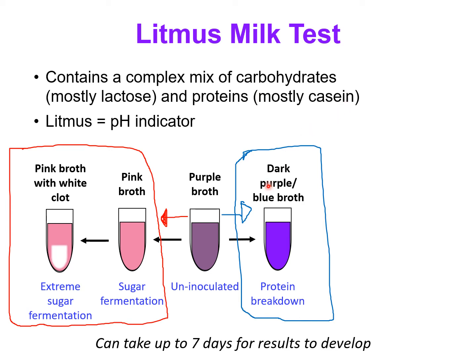So some bacteria, even though they can't ferment the lactose, are capable of metabolizing the casein, and so they're going to go down this pathway and metabolize the protein.